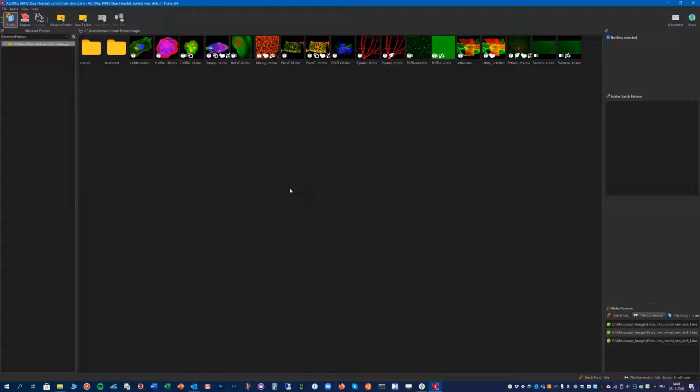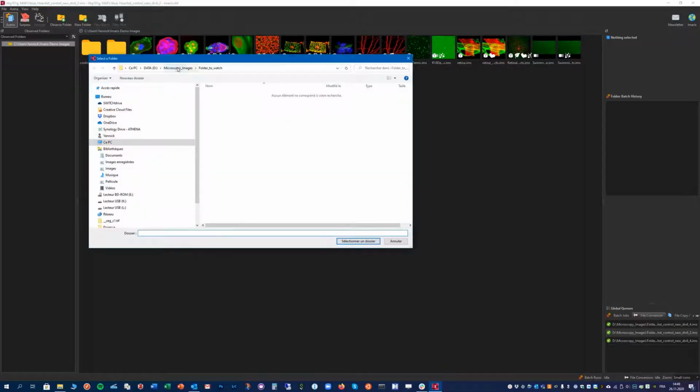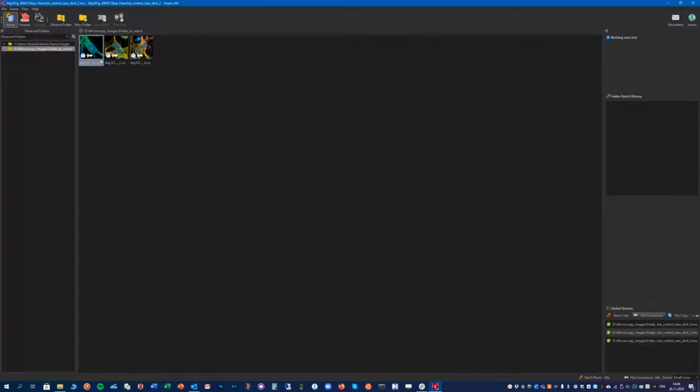Okay, welcome to this short video on how to use Imaris and the Cell module. To start, we need to add some datasets into Imaris, and in order to do that, you have to be in the Arena view here and select Observe a folder. When you do this, you can select a folder from your computer. Here it's called Folder to Watch. Select it, and you can see that it has already added all the images contained in this folder.